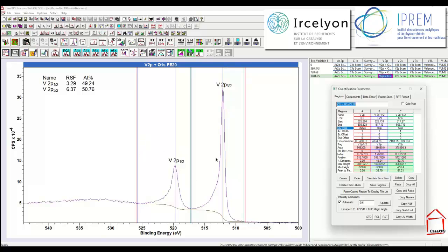If I wanted to use both peaks, so for example the region that represents where the Shirley background goes, then I would use the total RSF, and when I use the total RSF, because the total RSF is now integrating over this entire interval, I end up with 3 different RSFs, but they all produce the same answer in terms of the amount of vanadium, and that's exactly what we would like out of relative sensitivity factors and targeted regions that are appropriate for these sensitivity factors.